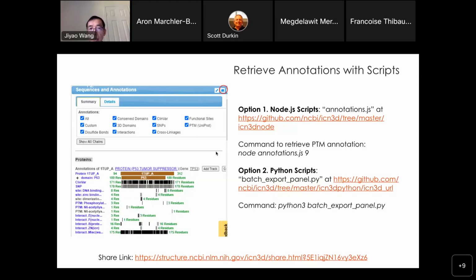When you click in the UI, it saves the HTML page for this, and this URL can just be replaced in this script. Just replace the URL and you will get the HTML page as output. So you just type the command. Again, everything is defined in this Python script.